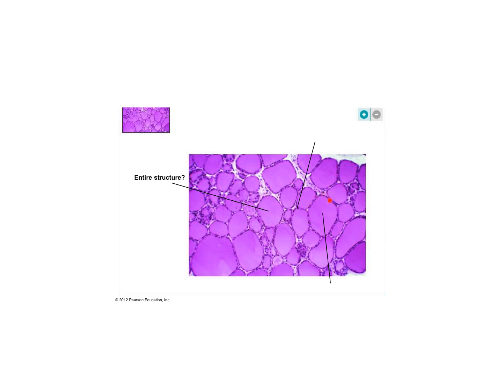And then the thyroid hormones, T3 and T4, are stored in a gelatinous material in the very center called colloid. So this is where T3 and T4 are constantly stored, and then they're released as needed. This line is pointing to these cells that come around in a circle. These are the follicular cells. And remember, the stuff in the middle, that's the colloid. So the whole thing is the follicle, just the cells on the outside are the follicular cells, and then if we point to the middle, it's pointing to the colloid.